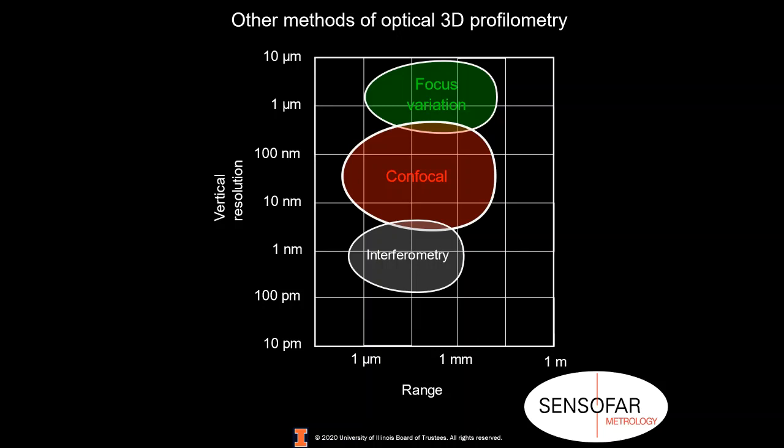Okay. This is a question for Kathy. How do the results for thickness and mainly roughness compare from this technique compared to other techniques like ellipsometry or X-ray reflectivity? Well, one of the cool things about X-ray reflectivity is that you can see through surfaces comparatively quite easily.